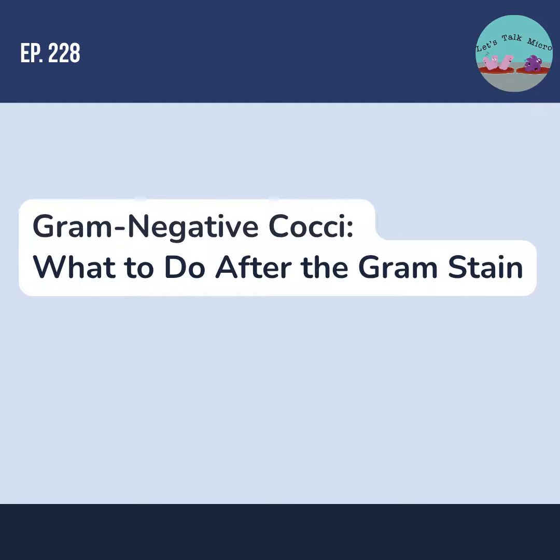So having growth does not automatically mean that you have Neisseria gonorrhoeae or meningitidis. If you see growth there, it should be followed by a gram stain to see what you have. And even if it's gram-negative cocci, you still have to do further testing because Neisseria lactamica and Moraxella catarrhalis do grow on modified Thayer-Martin.